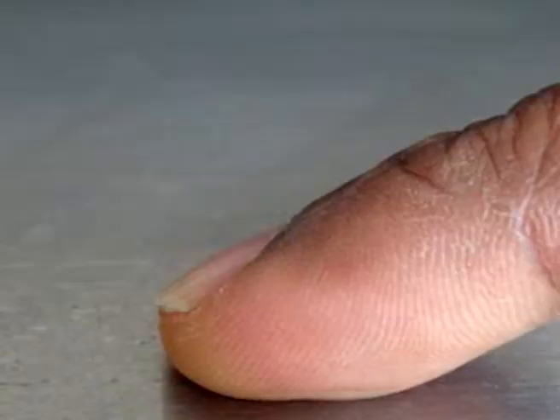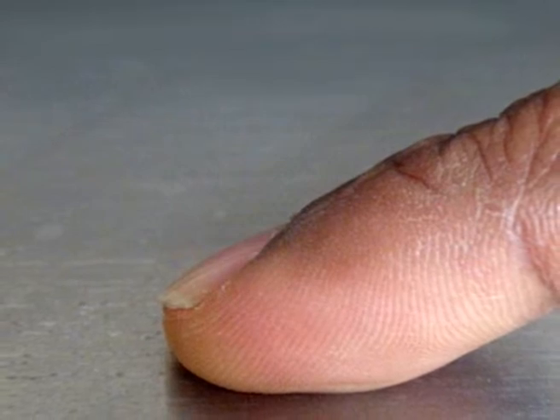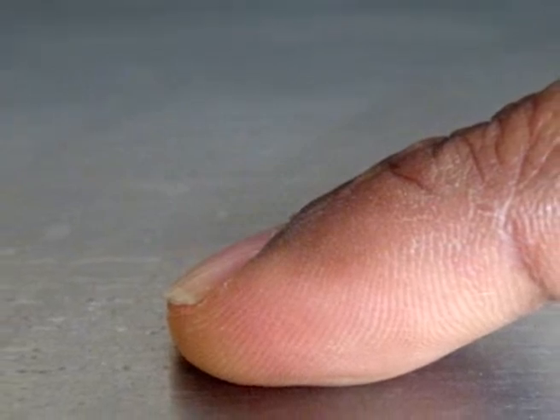Dear student, let us start today's lecture with amino acid specific reagents for detection of fingerprints. Amino acids are an important constituent of fingertip sweat. When a finger touches a surface, these are deposited thereon as sweat residue. This deposition, called latent fingerprint, contains several other chemicals such as chloride, phosphate, sodium, potassium ions, as well as fatty acids, carbohydrates and vitamins.